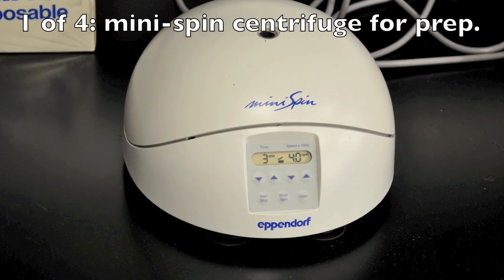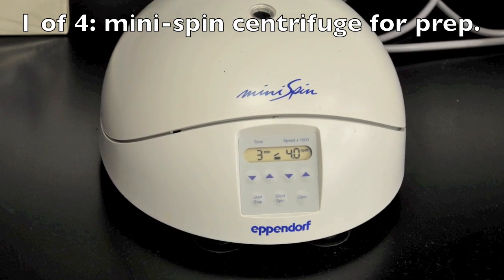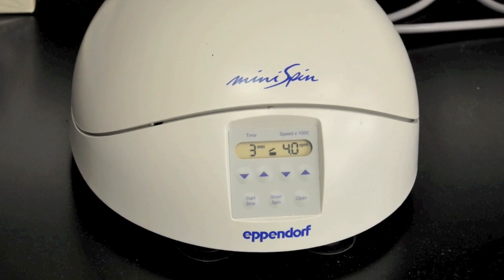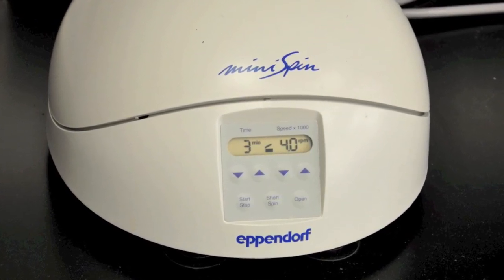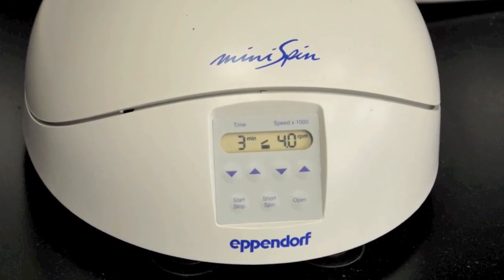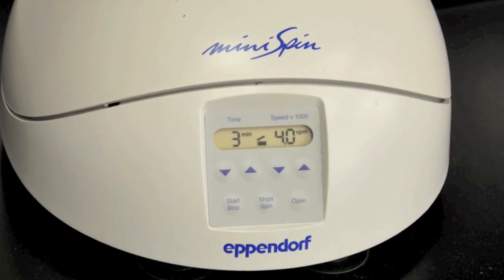This picture shows a basic laboratory centrifuge. This is a very small one that you might find on a tabletop. These are for student use where it's not going to have the same g-force as some of the larger centrifuges. It's designed for what we call pulsing down, or very quickly separating a precipitant from a solution.